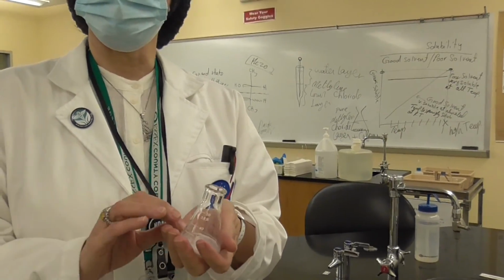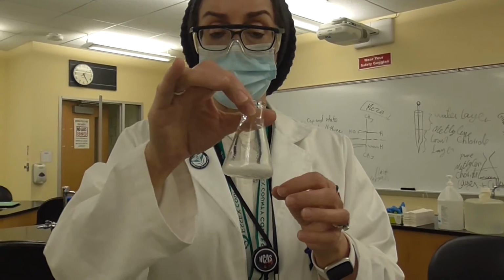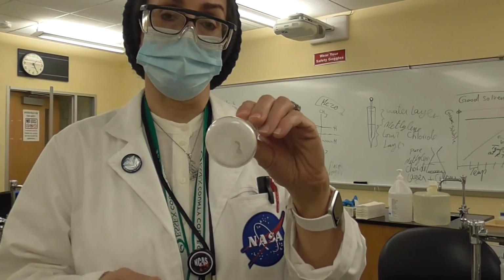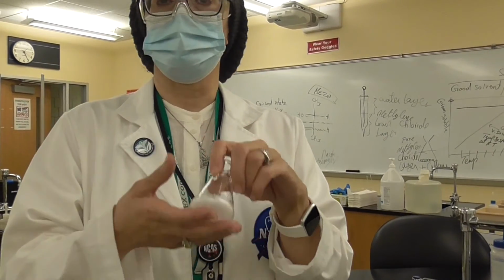We took the pure methylene chloride layer, put it on a hot water bath, and that is what happened, it actually evaporated the methylene chloride, and this is supposed to be the caffeine.